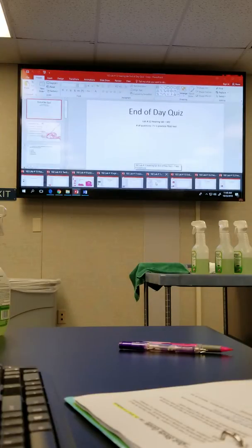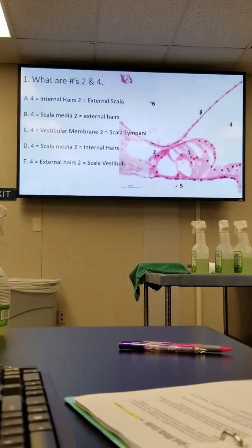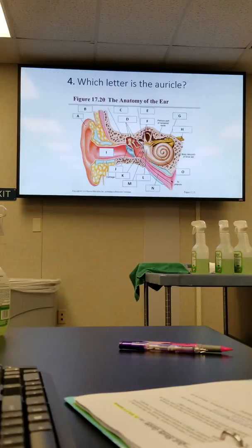Alright, let's see. This is 12. Hearing. You see that structure right there? Make sure you look at the cochlear slide. Make sure you identify the organ of Corti, the hair cells. Know everything about the organ of Corti, the scala tympani, scala vestibuli, all that stuff. So you want to look at the full slide. Make sure you understand these are about the ear, the breakdown of the ear.